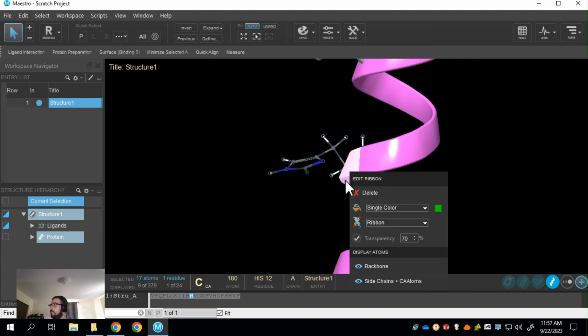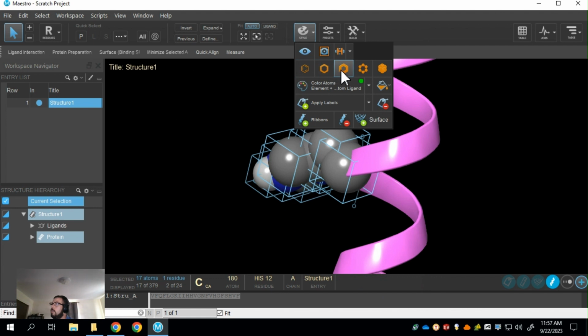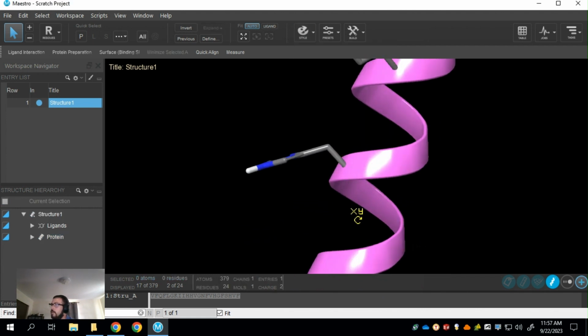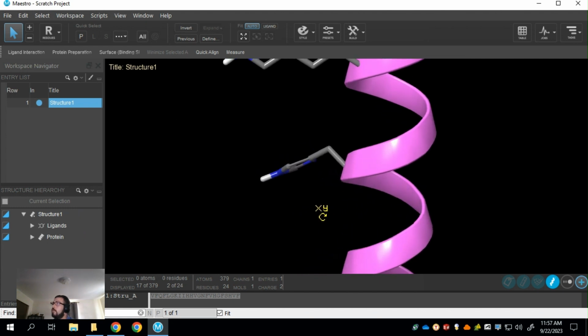Right click is doing it for me with a little bit of resistance. So again, I don't really care to see the carbonyls the way they're oriented. So I just want to check out the side chain. And again, I just want to verify because I had some trouble earlier. Yes, it is still attached, and so is the one above.